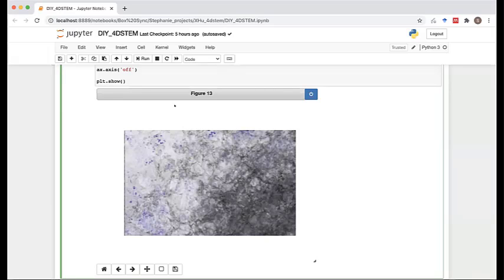The original data, if I remember correctly, was somewhere around 8 GB. So 8. Yeah, that makes sense because it was binned. Yeah, it was binned by 8, right? Yeah. And then 1 GB. It runs pretty well on any standard laptop.